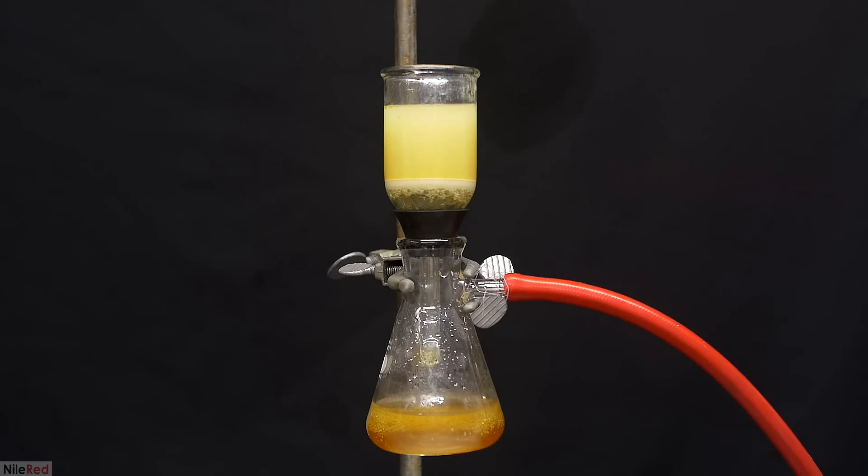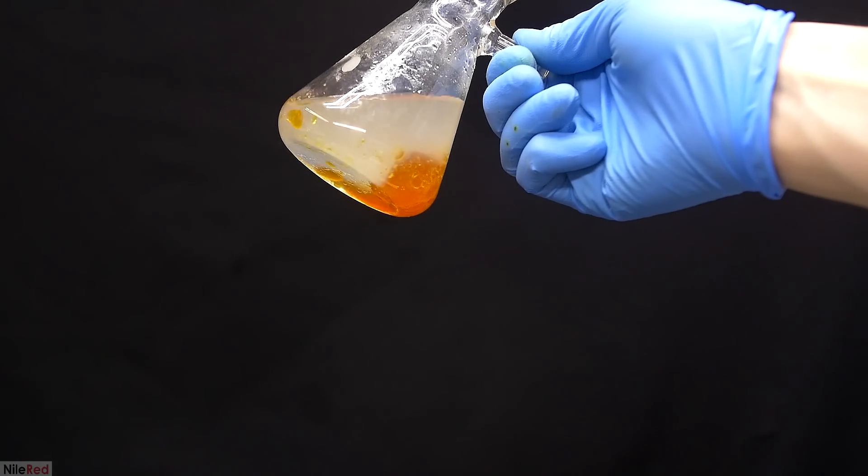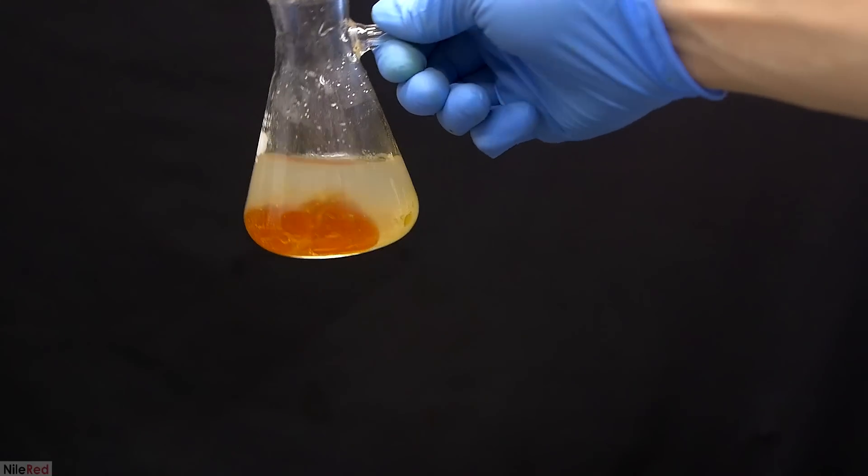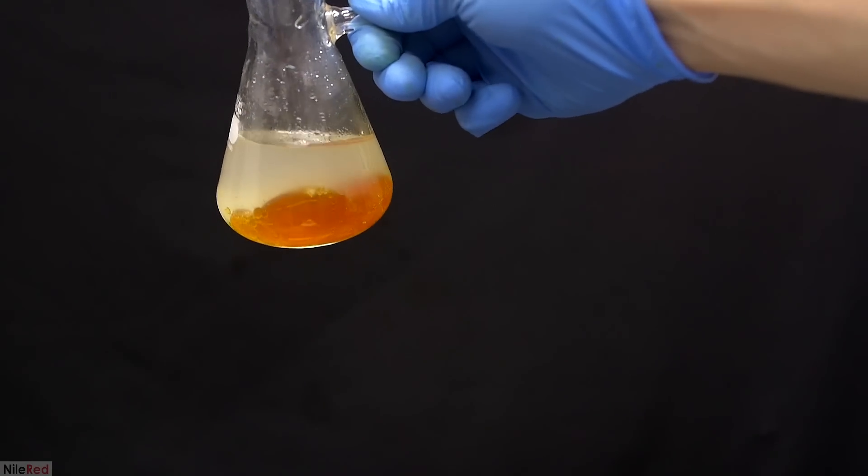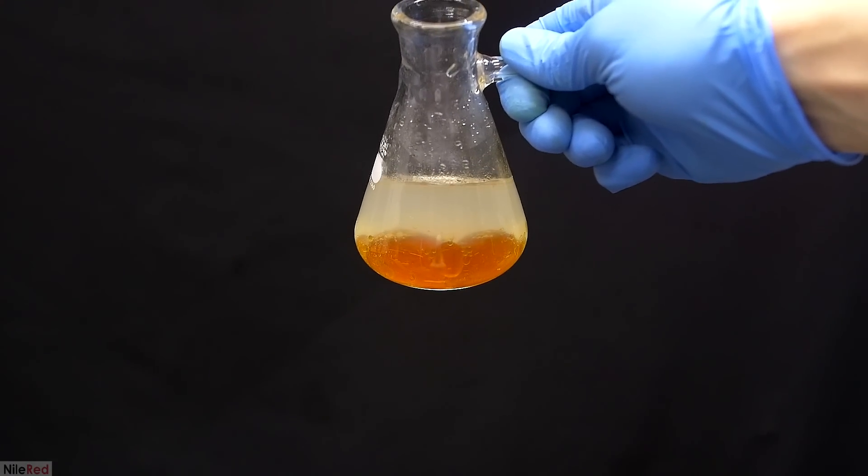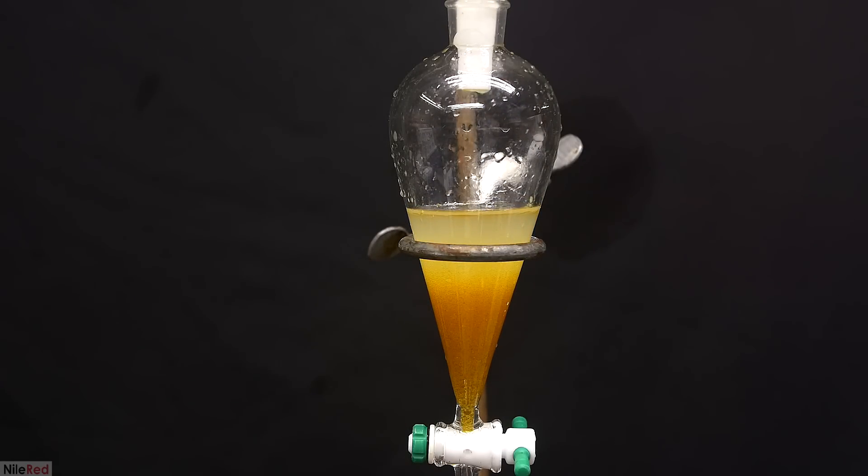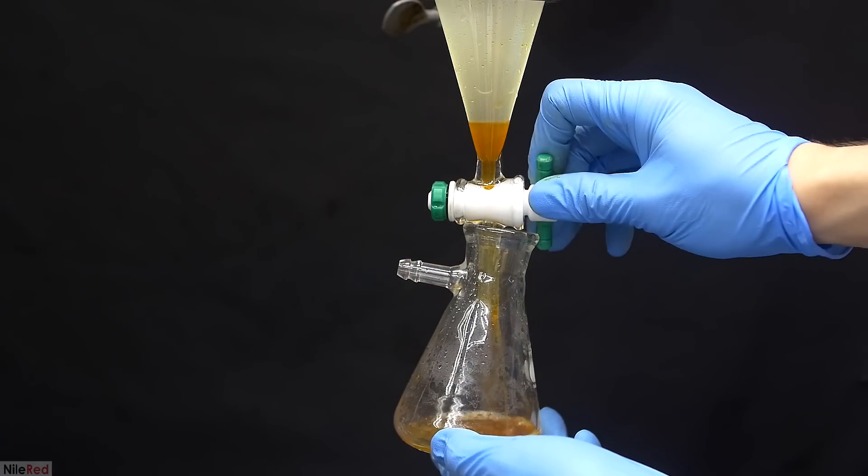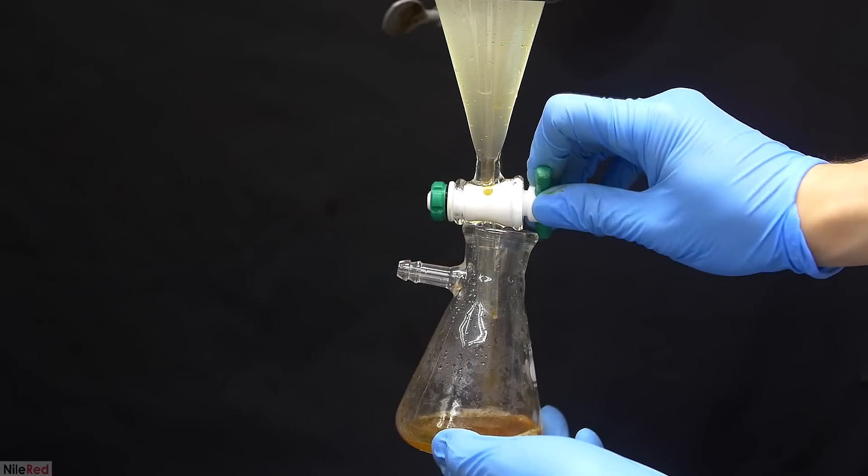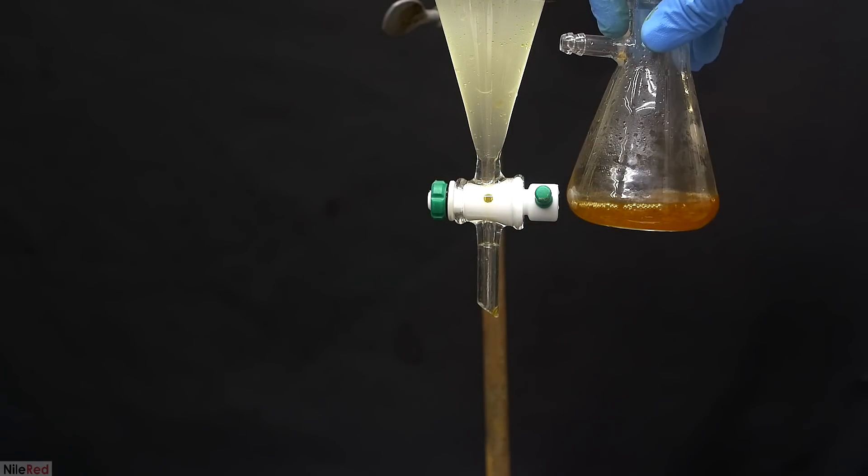After everything had filtered through, the Erlenmeyer flask was washed with a little bit of water. So now in the flask, we again have a mixture of water and oil and we're going to have to separate it using a separatory funnel. Everything is added back to a separatory funnel and I leave it for a bit for the layers to separate. The layers seem to separate pretty nicely and I drained our lower oil layer into an Erlenmeyer flask.